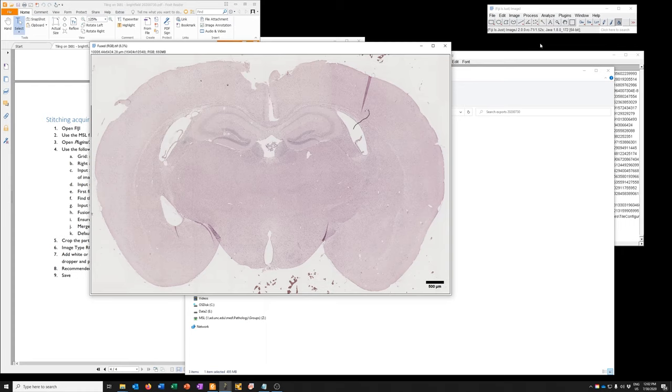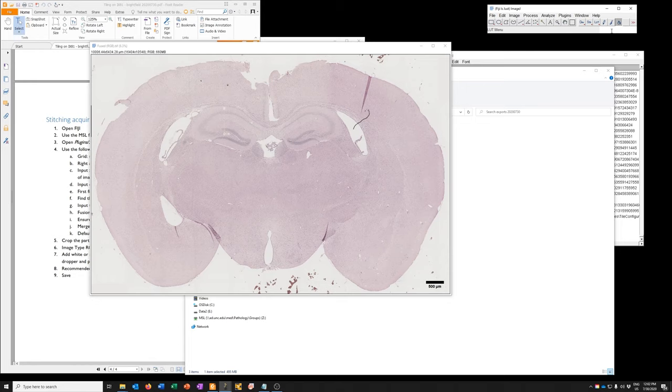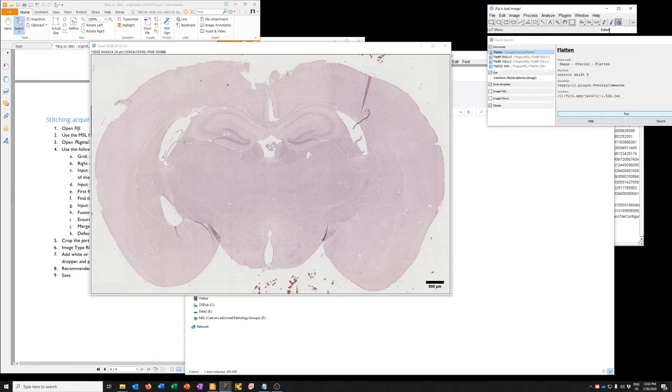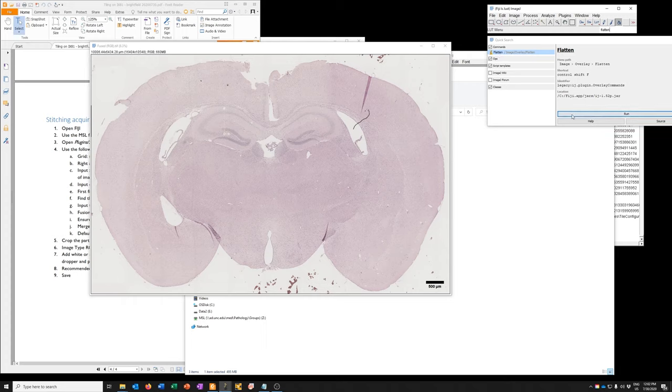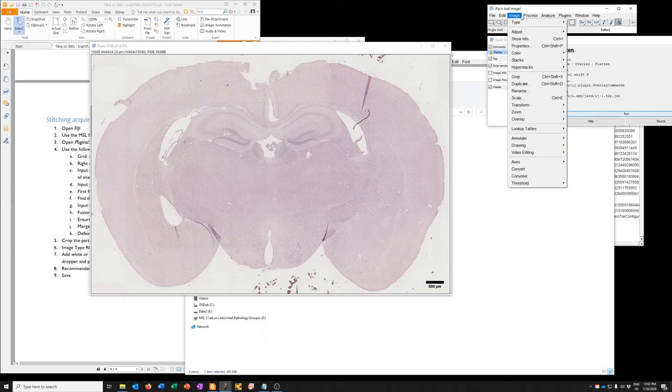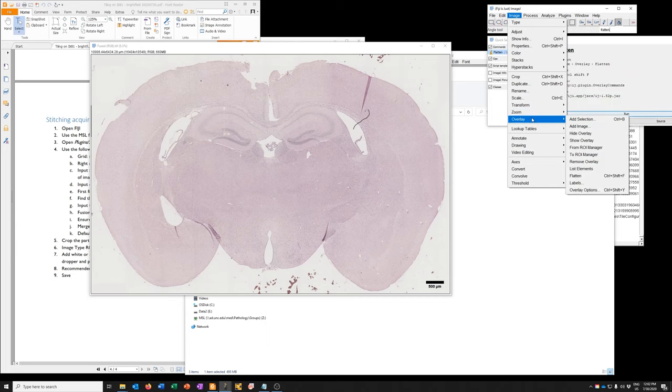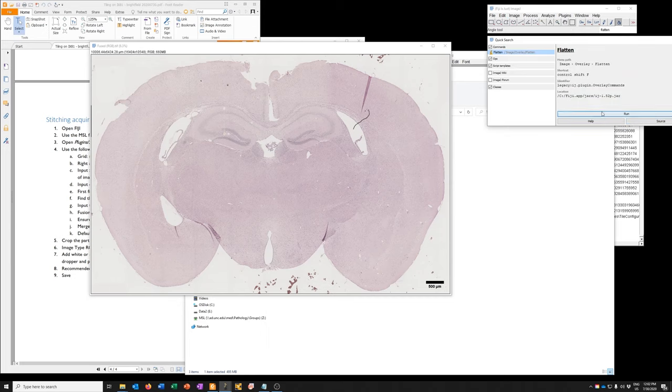just go back to Fiji and run the command called flatten. So I don't remember where it is in the menu structure in Fiji, so if you just click here and write flatten, it'll find it. And then you can just run it. It's actually image overlay flatten. So if you go to image overlay flatten, you get that command. It's also control shift F. Also we can click here and say run.